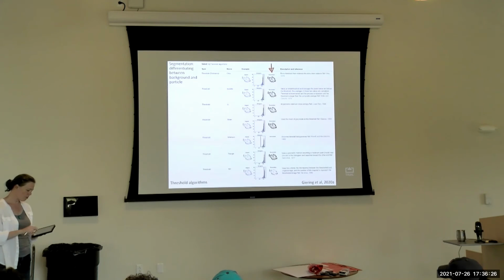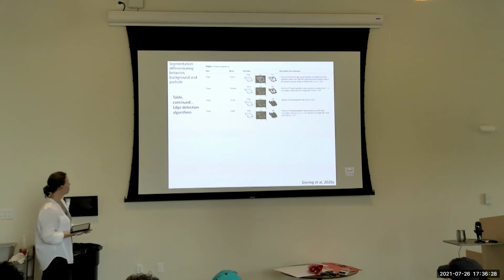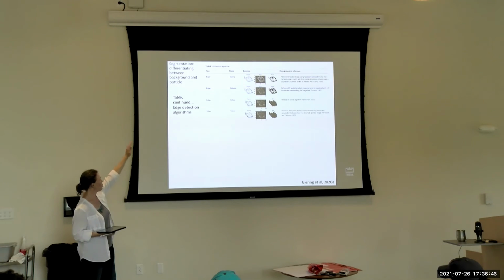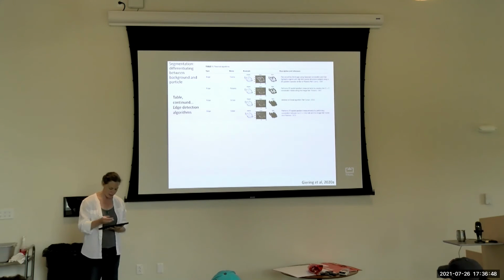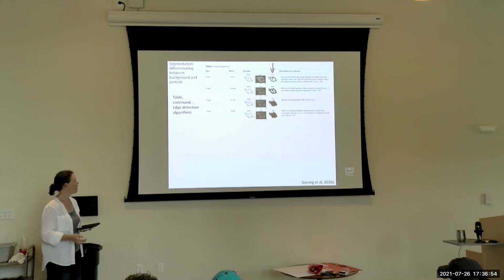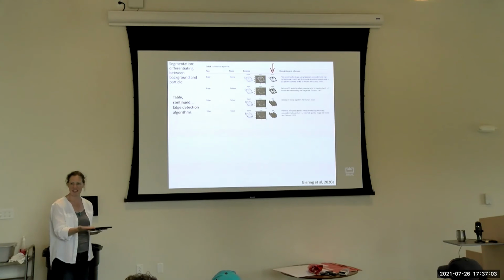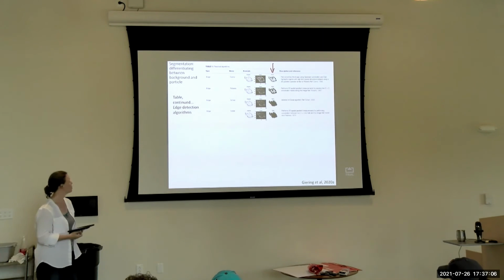There's also particle finding algorithms that, instead of just looking at the absolute level, the pixel gray level, look at the variability through the image. They look for high variance regions, and those are the edges of the particle. So there's 4 more. This is the continuation of that same table I showed you on the last slide. So here are some more outcomes of these different algorithms, right? These are now edge detection algorithms for finding particles. So if you're finding particles in an imaging system, you need to talk about how you found them in the first place. What algorithm did you use?